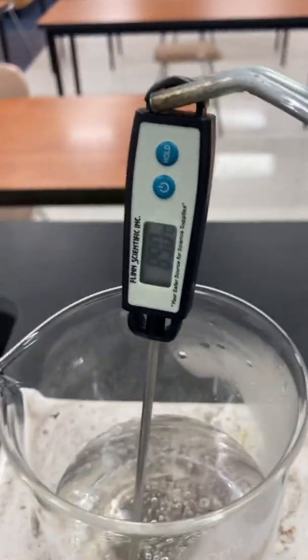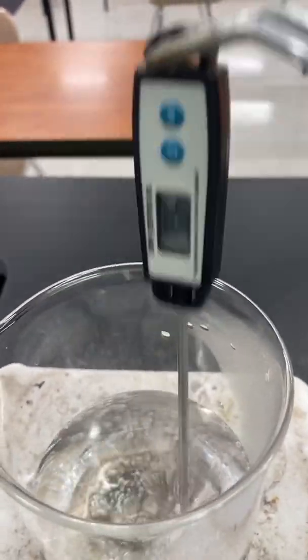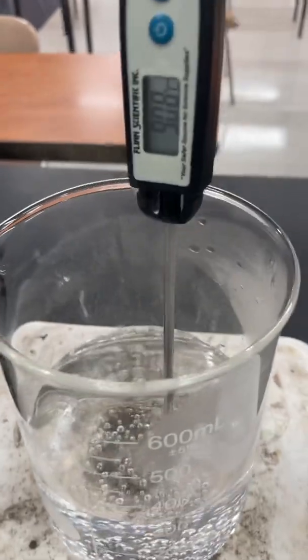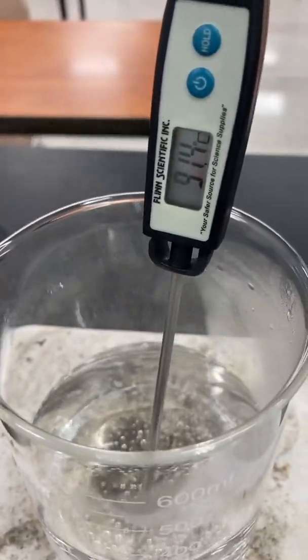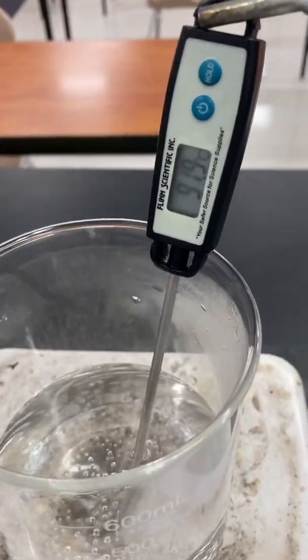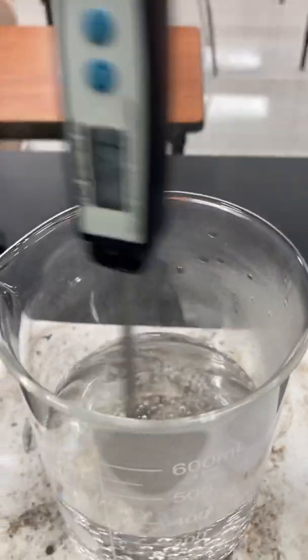Remember, this hot plate is pretty good at giving us even flow of energy or heat here at a pretty steady rate. Okay, now I'm seeing a bunch of steam. I wonder if you in the video can see a bunch of steam starting to come out of here. And we're getting in the 90s now. Okay, 90, it's even starting to fog up the reader here. 92 degrees Celsius at 11 minutes.